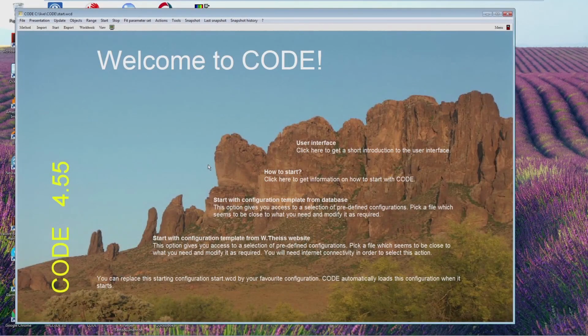Hello again. Today we are going to make some progress with our fitting capabilities. I will show you how we can do a systematic analysis of many measurements that you have done on a series of samples. In this case, it's a very simple example where people have recorded reflectance spectra of silver layers deposited on microscope slides, with the purpose to find out the deposition rate.